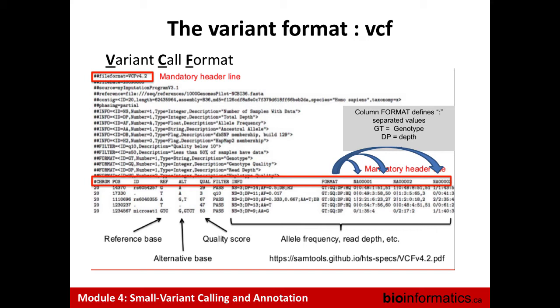And what genotype quality scores would you recommend that could indicate the genotypes you can trust and the ones that are compromised? It's complicated. It depends on each variant caller, because they don't compute the genotype quality with the same weight. Most of the time, I would say around that. For HaplotypeCaller, genotype quality of more than 40 starts to be a good one. Sometimes when we really want good quality calls, for example when we want to do some imputation, we only want to keep the calls that we really trust, and we do it at 60.